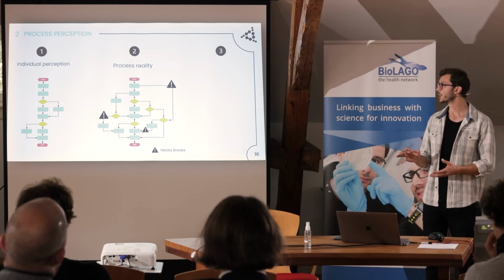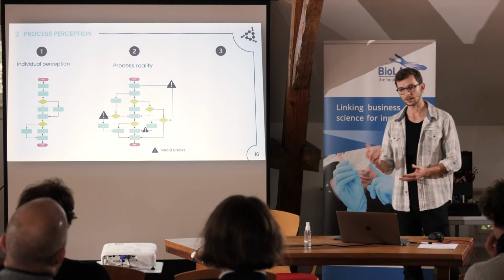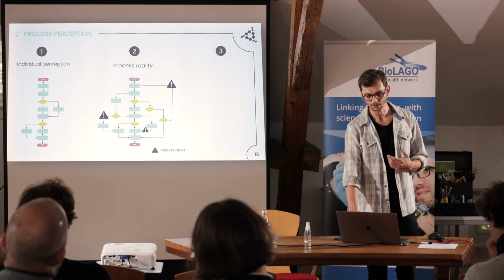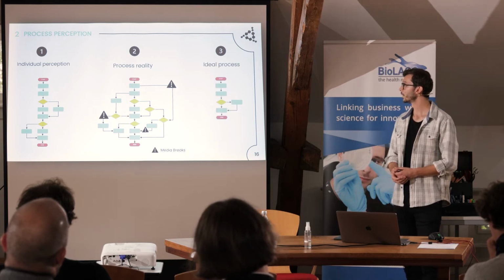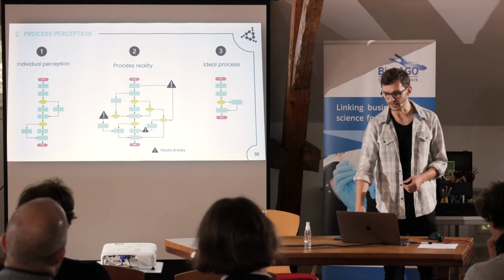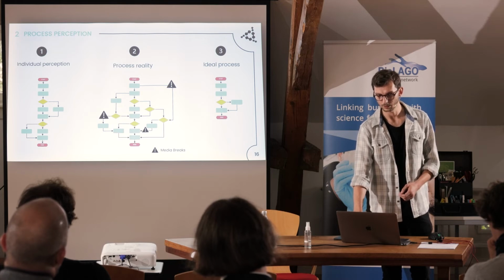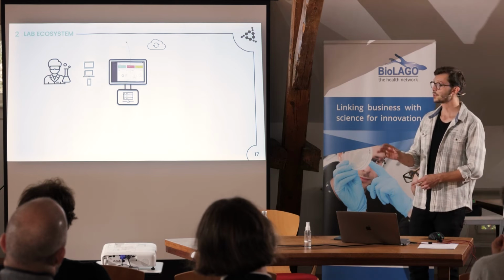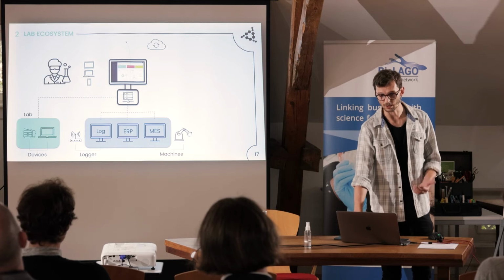A process is a combination of steps with different kinds of decisions and different kinds of time. And what we are doing is challenging these process networks, it's a little bit idyllic, to streamline the process, to get it lean, to use less time and less effort to get to the goal. What our goal is in the lab is a lab-centric LIMS, Laboratory Information and Management System, which is cloud-based.